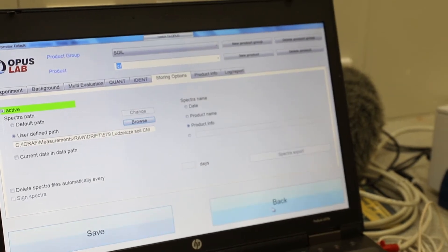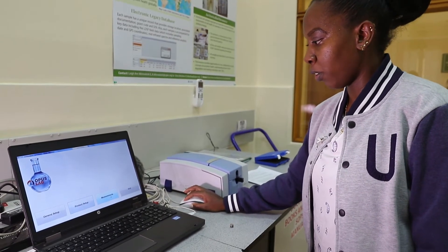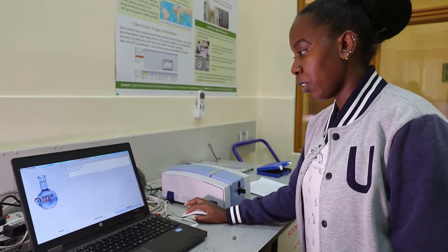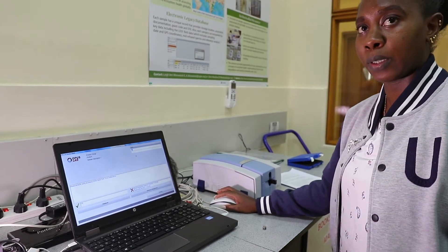I save and go back. After you have saved your file, you come to the Measurement icon, double click on it, go to the Start button, and double click. Now we are ready to analyze our sample.